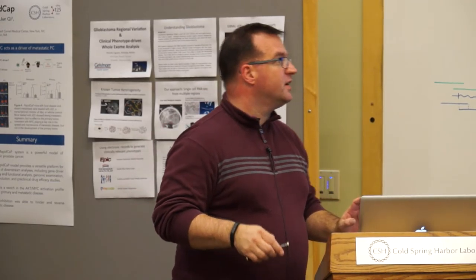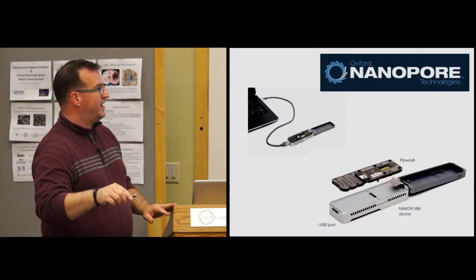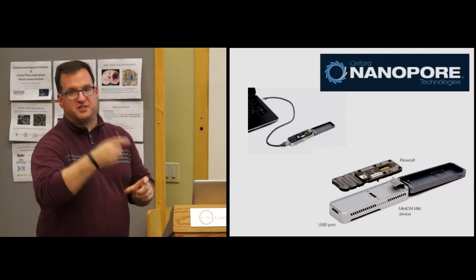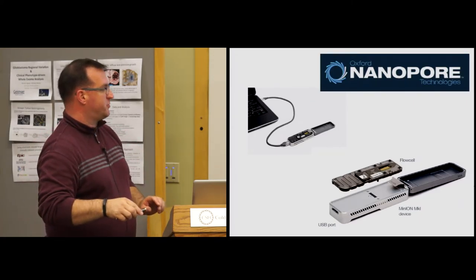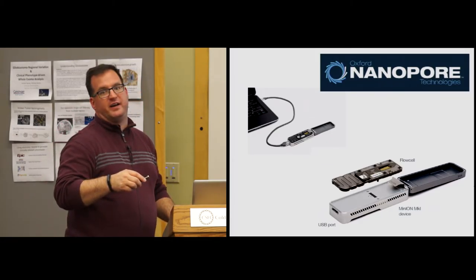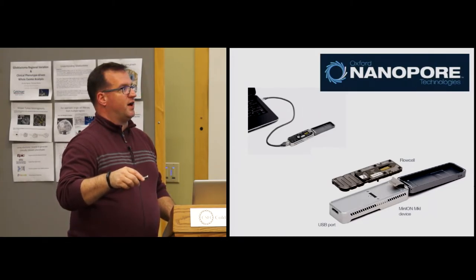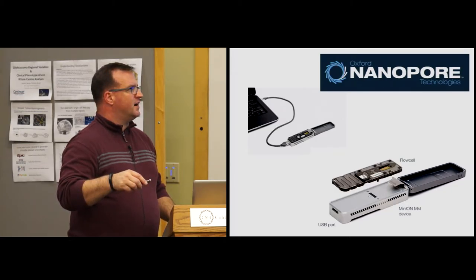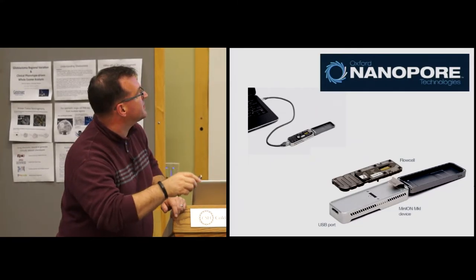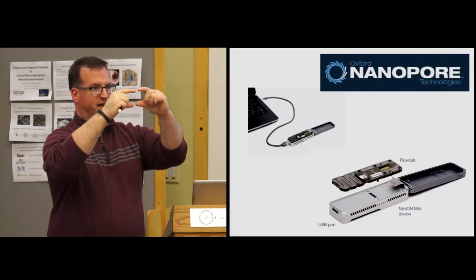Okay, so at the other end of the spectrum, these things are really tiny. Here is the MinION contraption, essentially the hardware, and then here's the flow cell that you would exchange with each sample that you squirted in. And it's just a USB, you know, this is it. This is the sequencer right here. This is the whole thing. This little box. This is the consumable that you have to replace. Here's the computer and here's the USB port. So it's about as big as a thumb drive. It's that big.